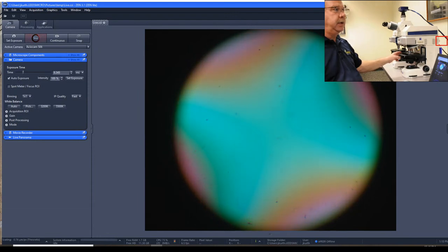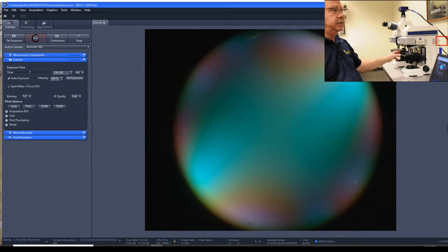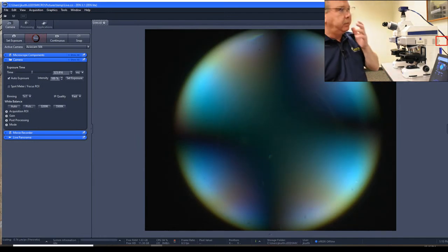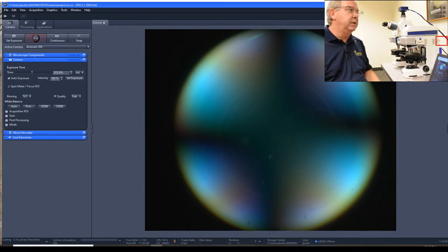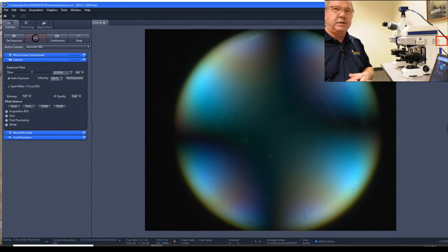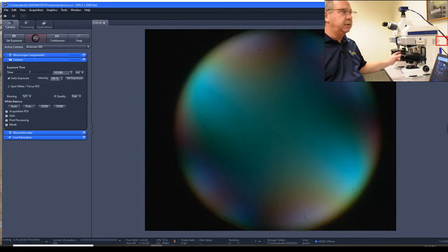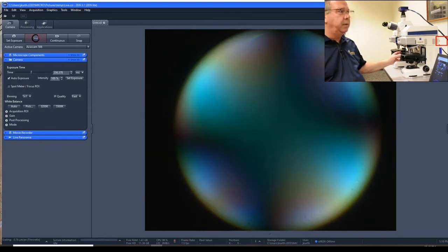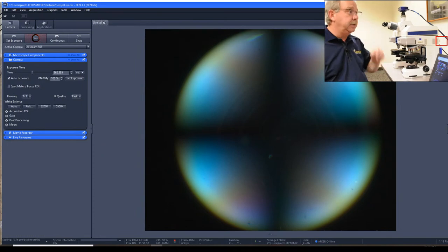As I slowly rotate the stage, you're going to see — they don't show up quite as sharp as I was hoping, we lose a little bit on the camera — but these black lines that you see are called isogyres. By looking at those isogyres, we can start to interpret the crystal structure. This one actually has two isogyres that come together to form this classic Maltese cross.